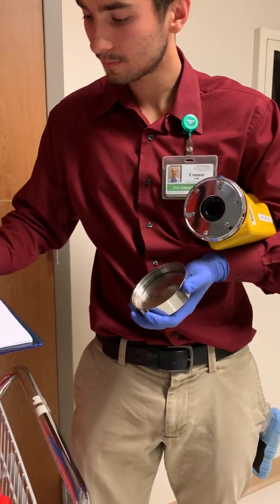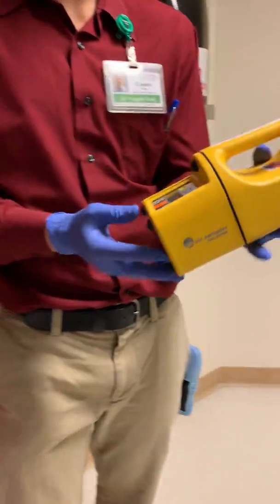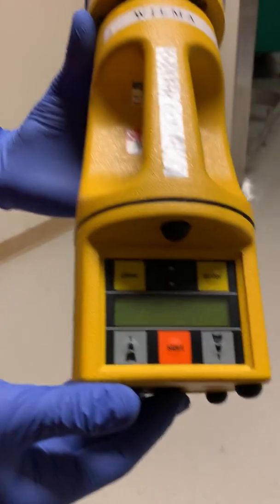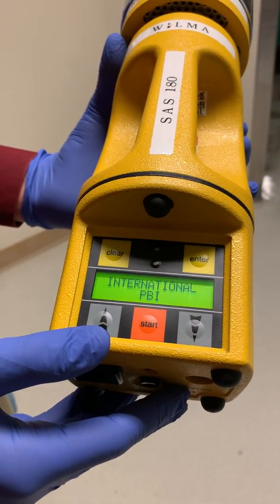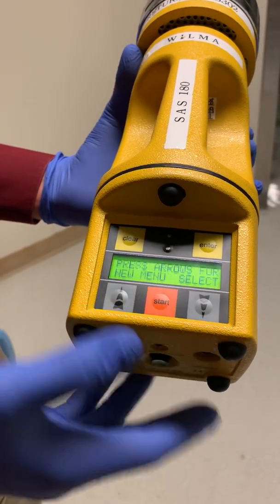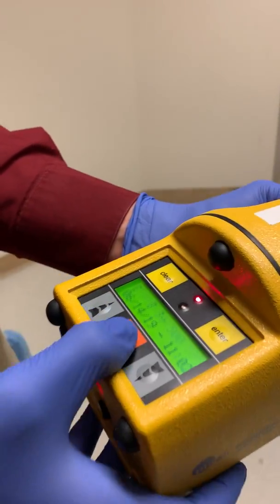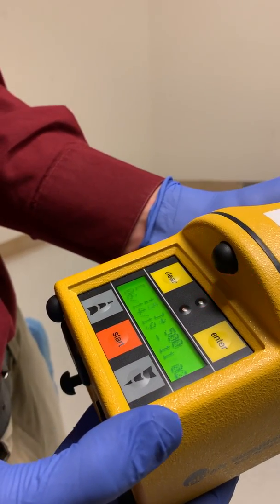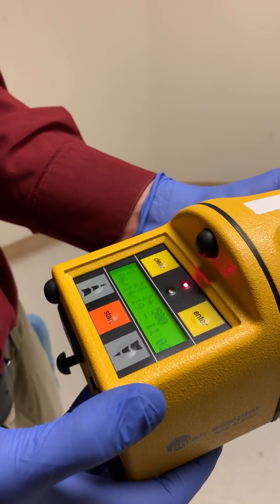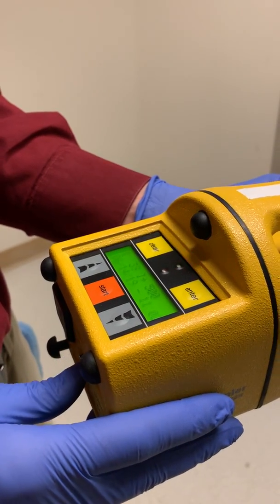In order to get rid of all the ethanol, we run the air sampler. We turn it on — it takes a few seconds to load — and we run it for 40 seconds. This part gets rid of all the ethanol, and now we're ready to begin our air sample.